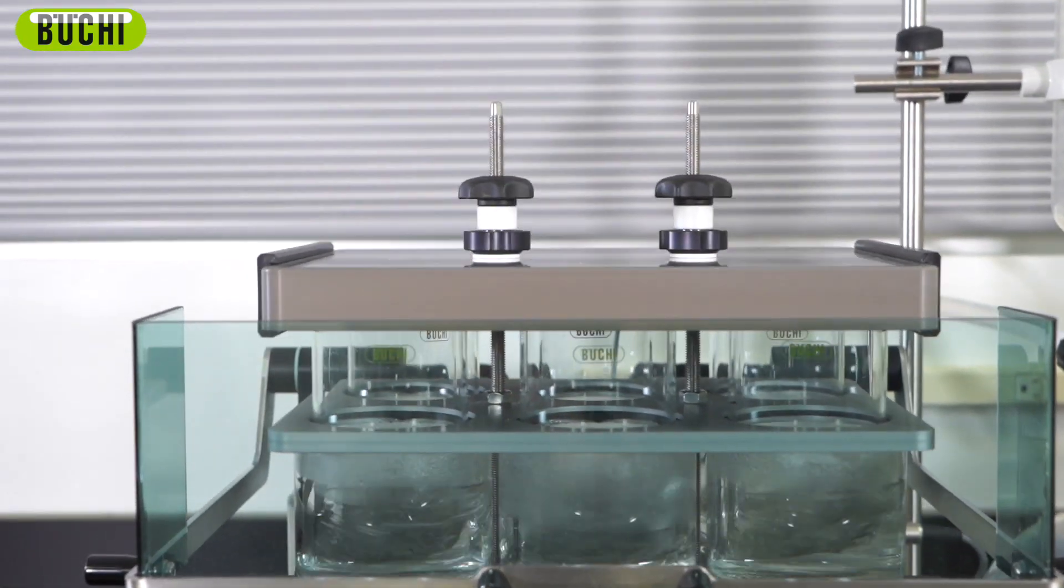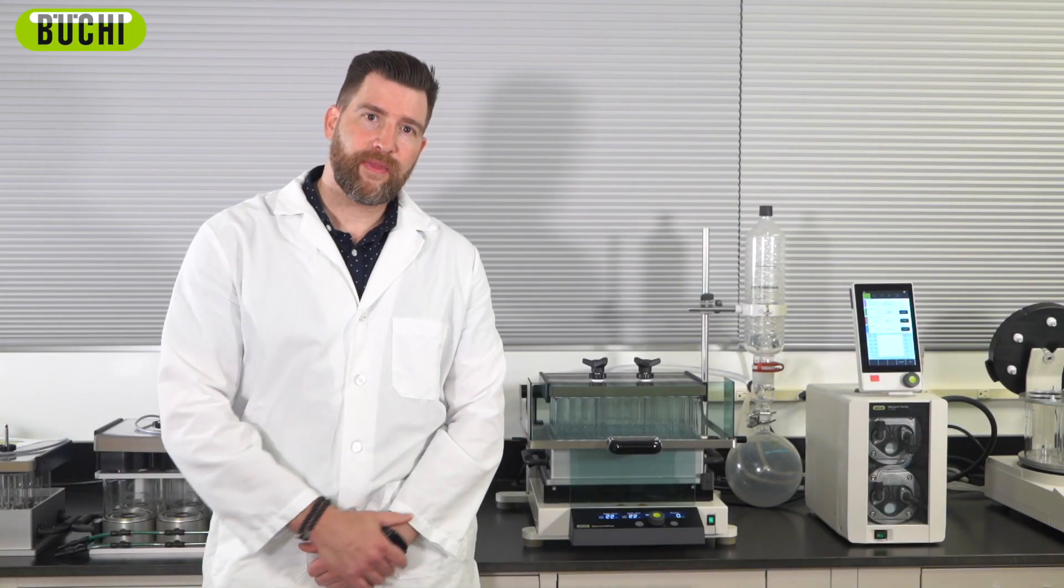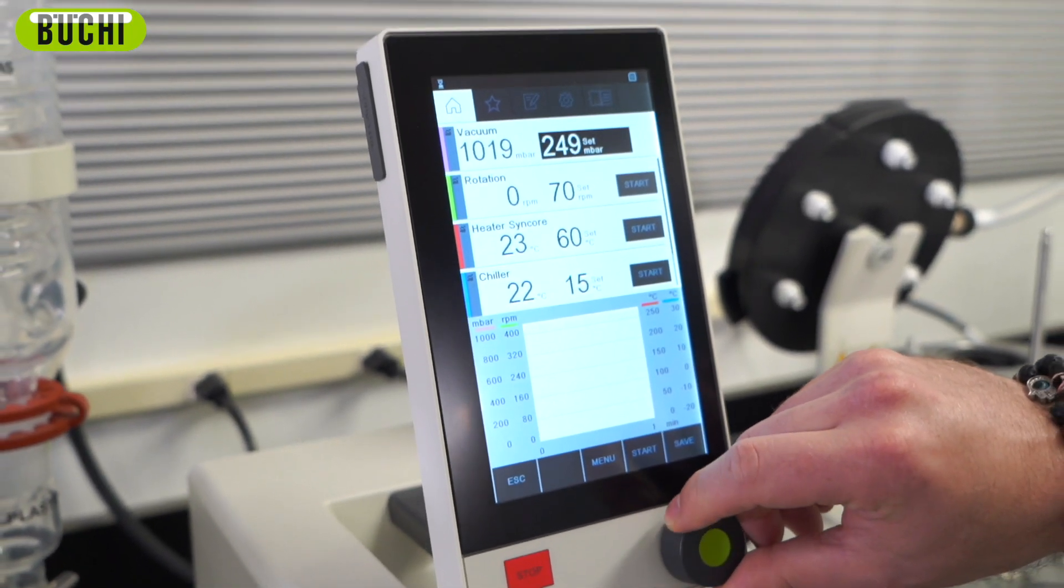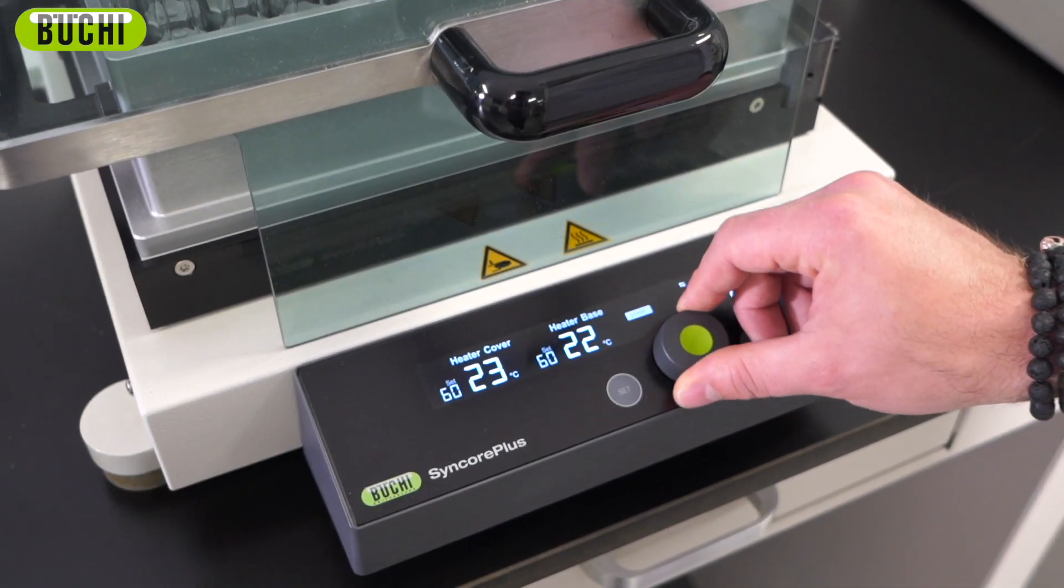Buchi's Syncor Plus Parallel Evaporator, which you see here, comes standard with easy to use automation features, which assist in either high-throughput sample drying or concentration.